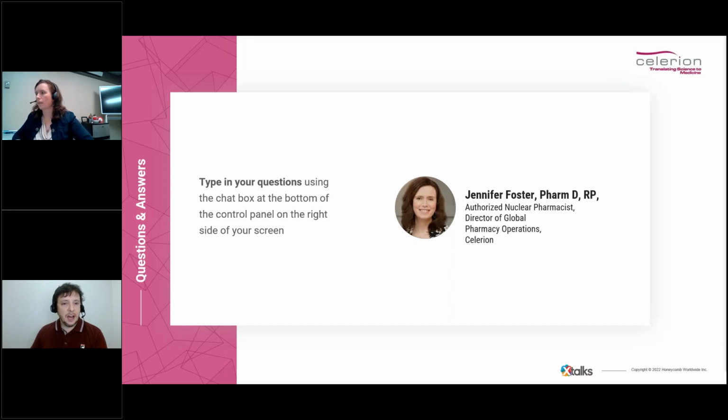Fantastic, thank you. Next question would like to know, what type of water do you use for non-sterile API solutions, and what is a good BUD assigned? Yeah, so the water that we typically use for these preparations is AquaPure. That's the brand name, and we use that because we can get a certificate of analysis with it, and then we can add that to our pharmacy documentation.